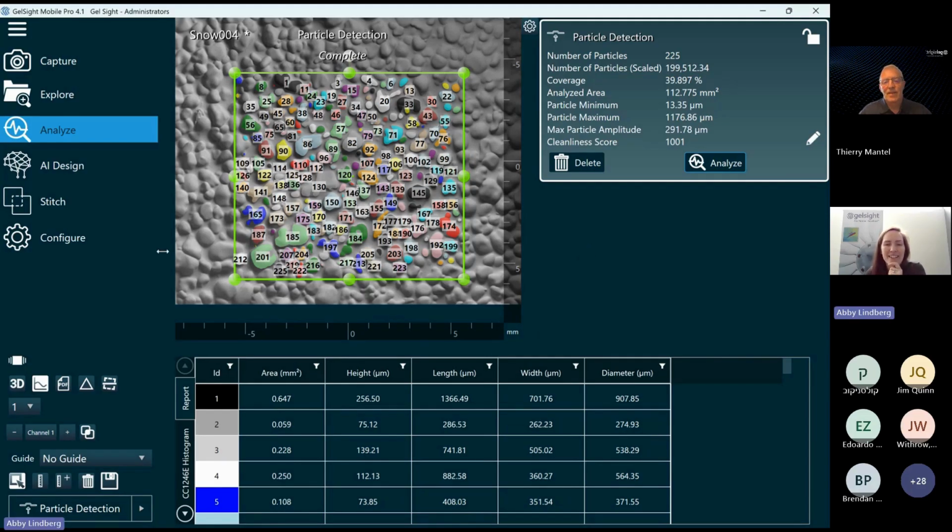All right, and then the next category of analysis that we wanted to talk about is interfaces of materials. So, we talked about the defect on the smartphone, but we could also talk about the interfaces between materials. We have on this phone where it switches from glass to metal. And that can be a typically challenging application for a lot of other measurement systems as well.